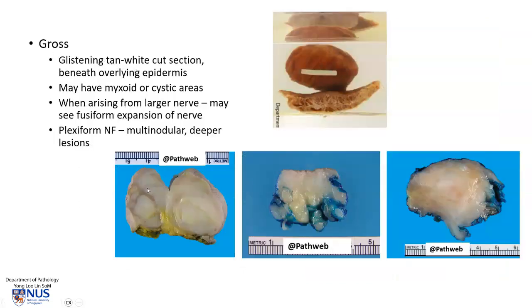Grossly, there is usually a rather glistening, whitish cut surface, and it is just beneath the epidermis. Here we can see the epidermis, and there is this whitish area which is the region of the neurofibroma. This lesion is a little bit more nodular and rounded — again, we can see the skin, the epidermis, and this glistening whitish appearance which is characteristic of neurofibroma.